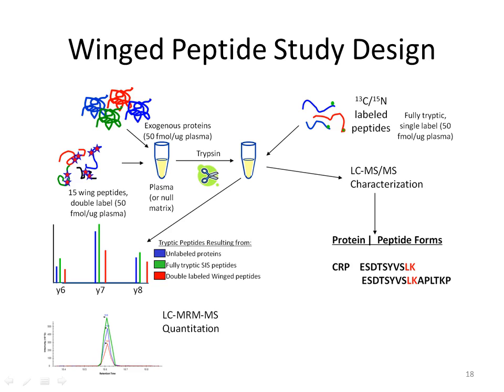In the process, instead of just targeting, we also did some data-dependent experiments to see if we saw any alternate forms of these peptides, because we were targeting fully tryptic, but were we going to see some ragged ends, where trypsin doesn't fully cleave really well, and you might see some partial extensions or things that aren't fully digested?